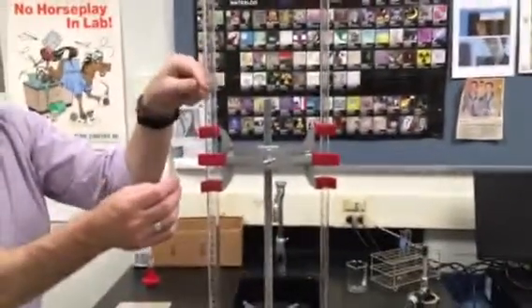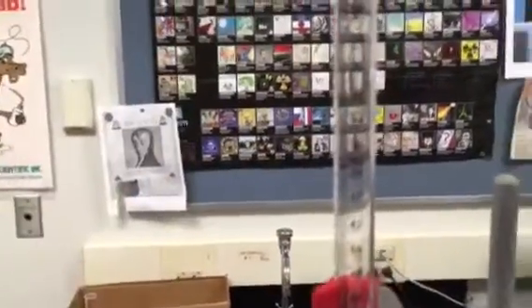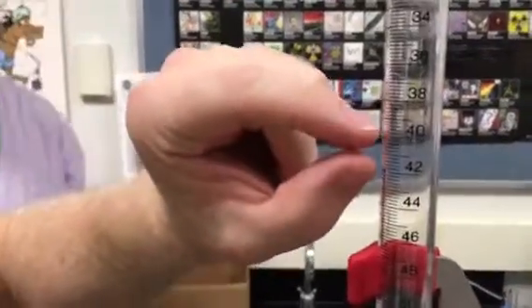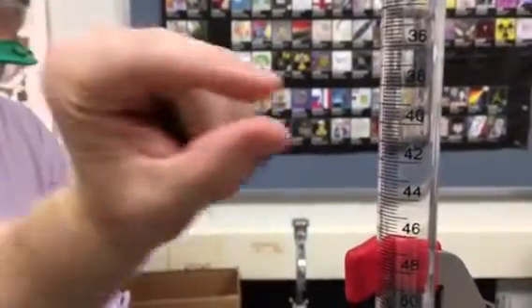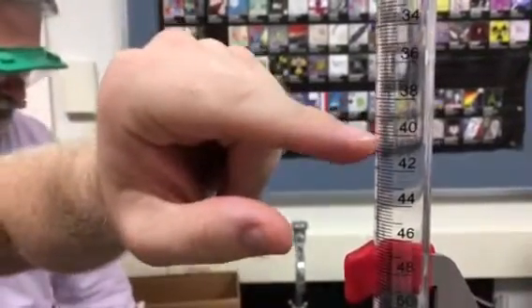It's dispensed, and over here we have a 100 milliliter burette. Because the numbers go up, this is different. Watch out. This one's tricky because it's not on a perfect scale of 10. We're going up by, well, I guess down if you look at it this way, by 0.2.